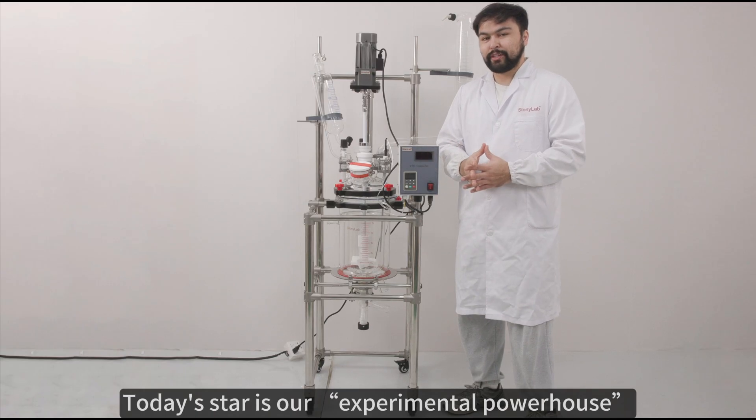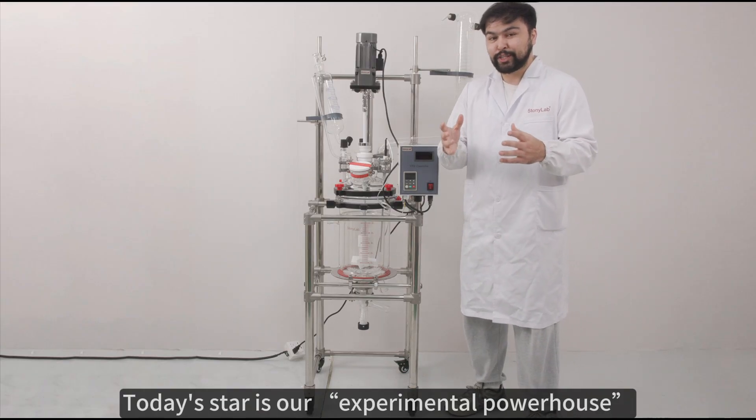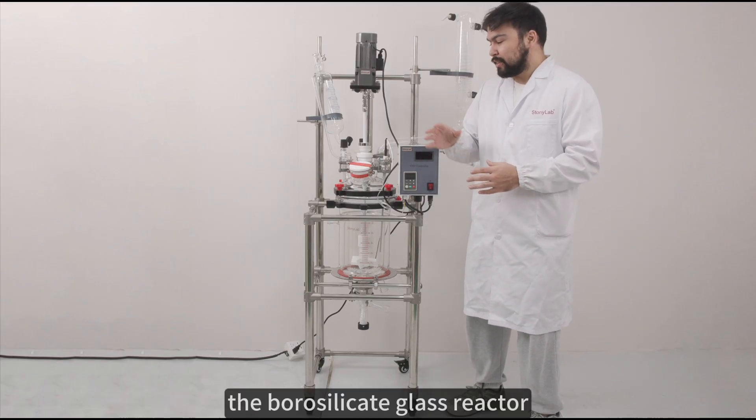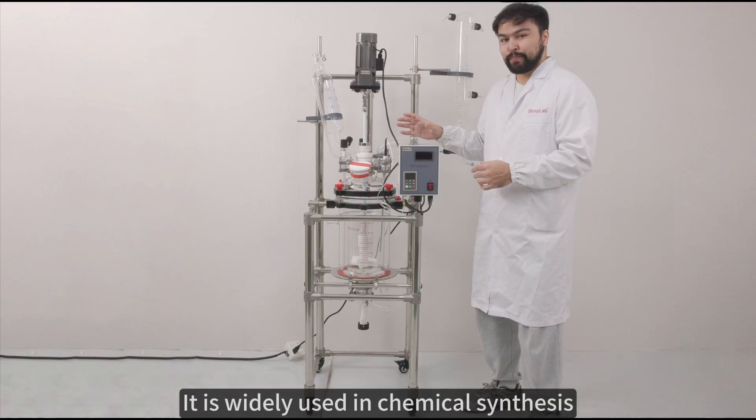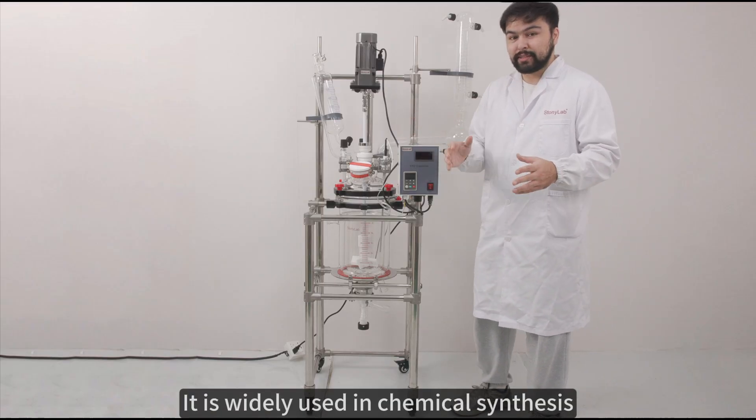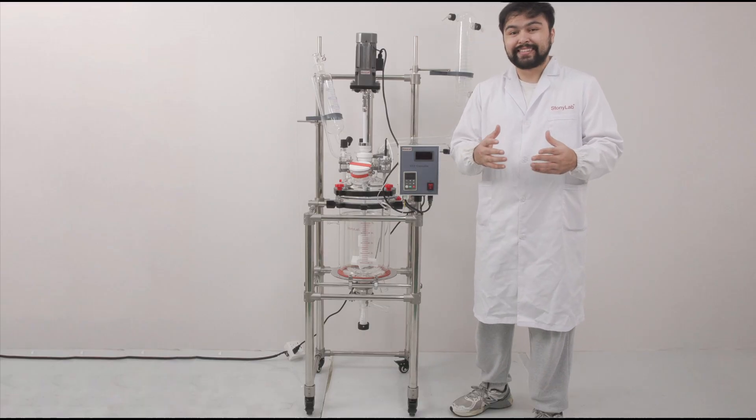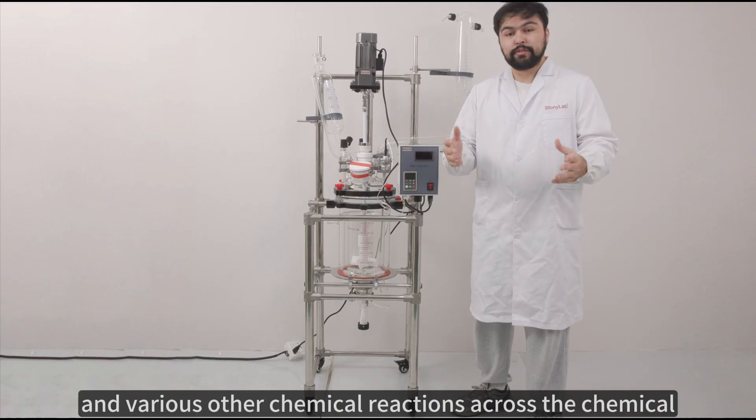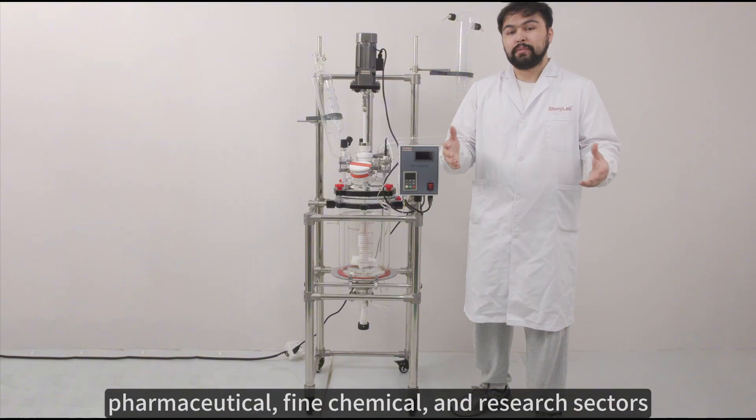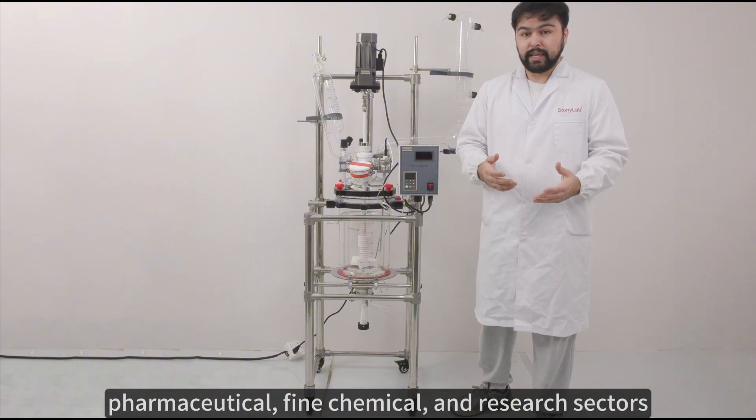Hello everyone and welcome to Stonia Lab. Today's star is our experimental powerhouse, the borosilicate glass reactor. It is widely used in chemical synthesis, decomposition, polymerization, condensation, and various other chemical reactions across the chemical, pharmaceutical, fine chemical, and research sectors.